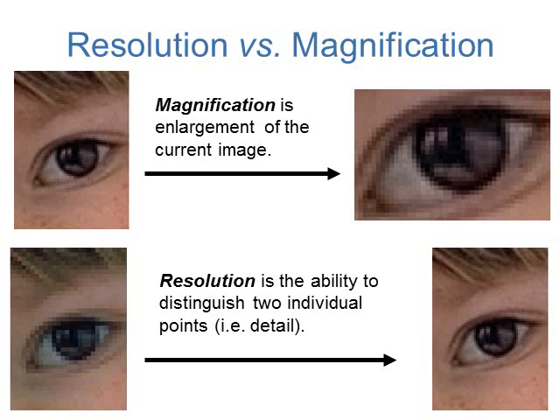So the resolution is just your ability to distinguish between 2 individual points, or to distinguish the detail. So resolution is analogous to pixels on a camera. So the more pixels you have, the higher resolution, the clearer the picture, especially when you zoom in on the picture and magnify it. So we need both of these things working at the same time in a really good microscope.